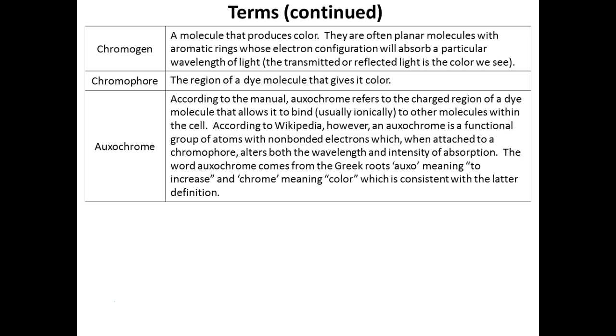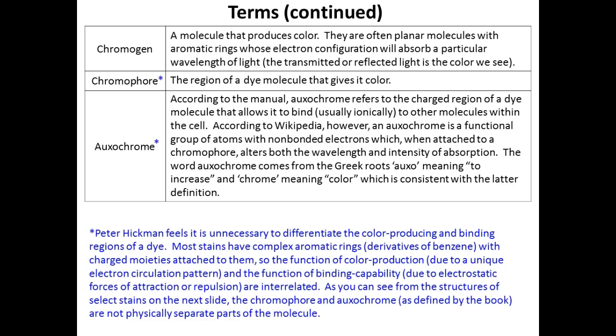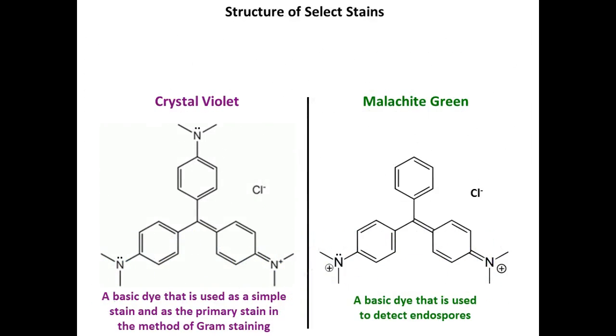As it relates to this terminology, it's in your book. It's kind of confusing, right? Peter and I agree that it really isn't all that important which part is the color and which part is charged of these dyes. The important thing is that the dyes contribute color, and why and how they interact with your cells is dependent on what charge they have, right? So these terms, I promise you, I will not ask you them. But they're in your book, and they're defined for you there.